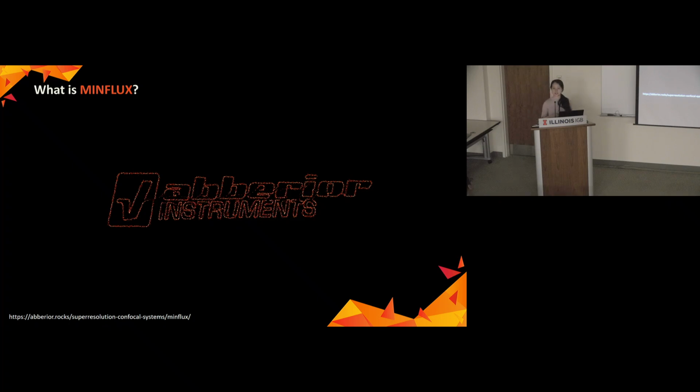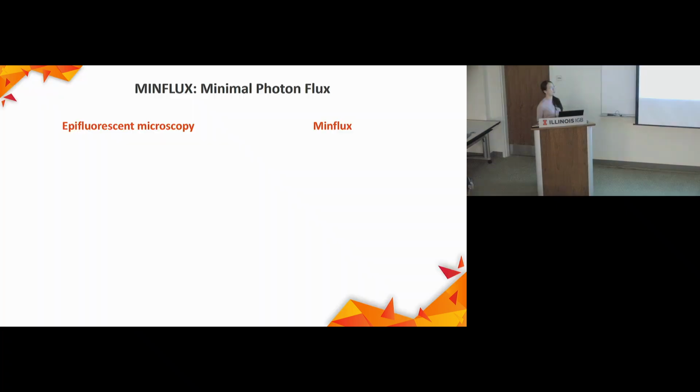So when I introduced this system to my friend, the first question I got was, so what does MINFLUX stand for? Why is it called MINFLUX? This is a really good question. Why is it called MINFLUX? We need to answer this question by understanding how MINFLUX works. So I'm going to explain that by comparing MINFLUX with the epifluorescent microscopy.